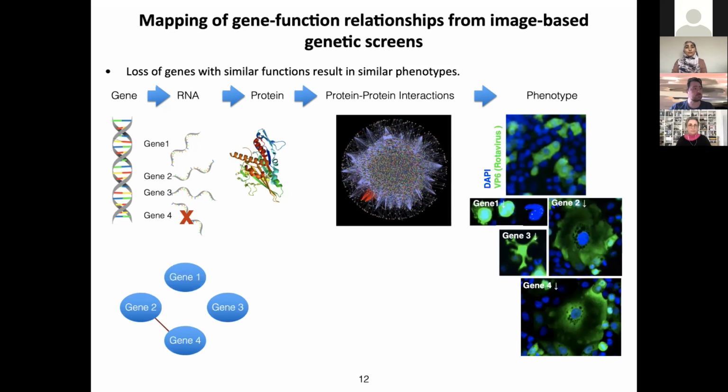However, analysis of these data sets, once we start doing genome-wide screens like 20,000 gene knockdowns, becomes very challenging. People who started doing these screens started with big hopes. But in the end, they were only able to focus on one feature, because we couldn't make sense of the entire spectrum of features we derive from these screens.